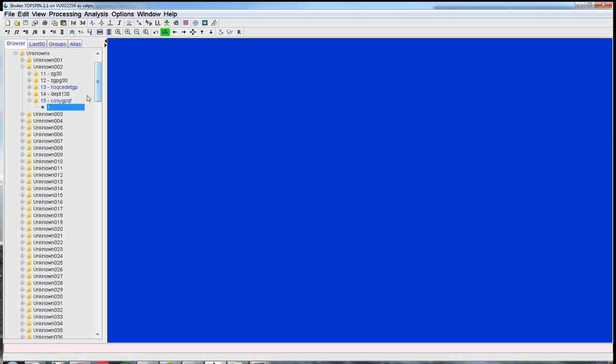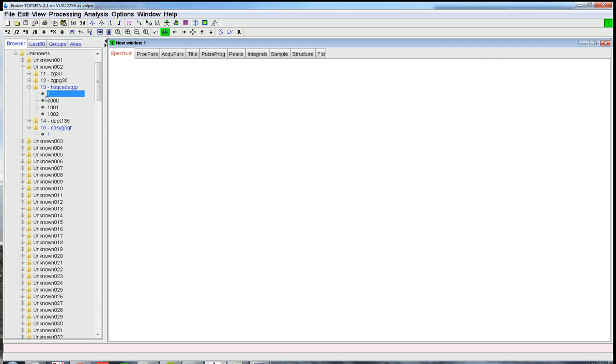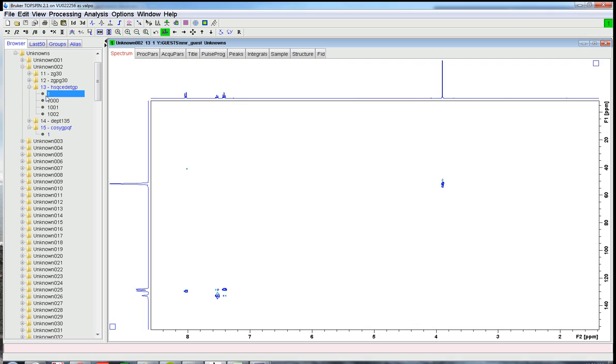All right, and now the HSQC data. So double click, and double click on the one here. Okay, and this is a huge data file, and again, it might take 10 seconds or 30 seconds to pop up here. All right, so there it is.